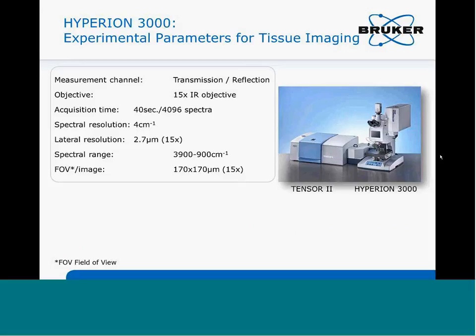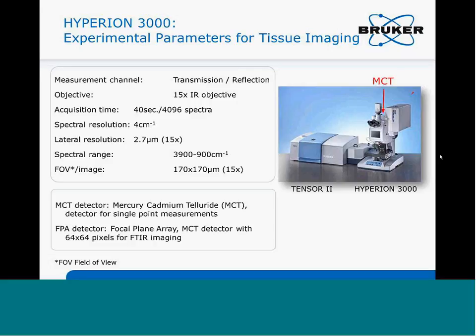So you can use microscopy not only for small particles, but you also can do chemical imaging. So basically what is chemical imaging? You measure spectra in the X and Y directions and profile the surface of the sample, which gives you the distribution of chemicals on this sample.